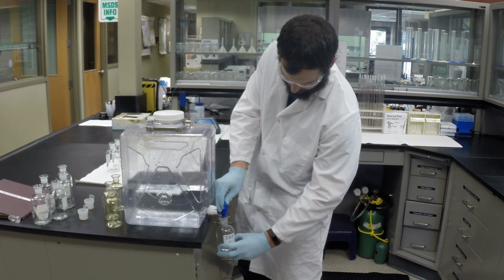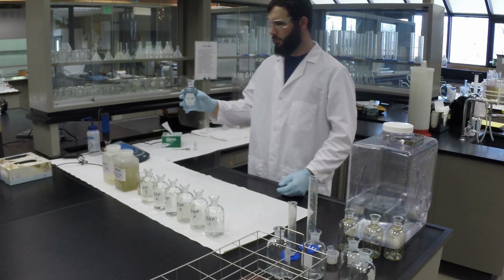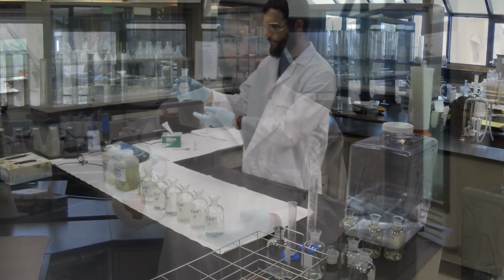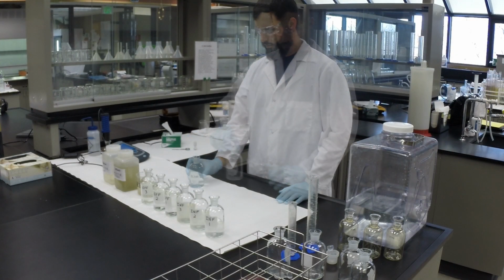If the samples are carbonaceous BOD, add the nitrification inhibitor. BOD blanks. To create your blanks, fill a 300 milliliter bottle all the way up with dilution water. Each run requires at least one blank. Blanks are used to show that your dilution water has not been contaminated.